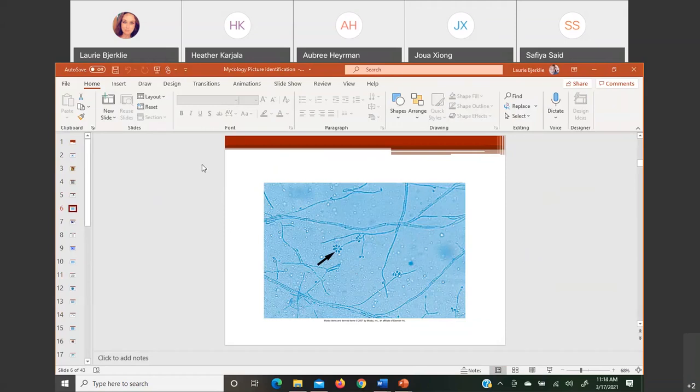Here we go again. So okay, like I was saying, Sporothrix schenckii, part of the dimorphic fungi. So dimorphic fungi again, it can be both a yeast and a mold phase. The yeast tending to occur in the body temperature range, 35 to 37 degrees Celsius, the mold in the room temperature range. Okay, and the key with Sporothrix, but you guys already know this, is it kind of clusters at the tip there. So I think it looks like a little daisy almost.